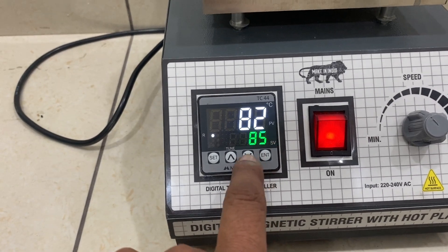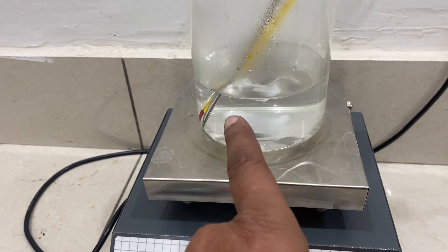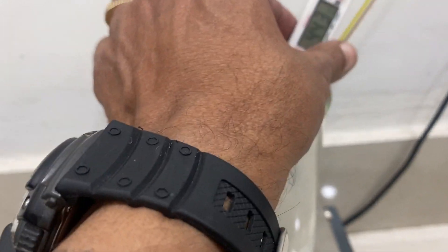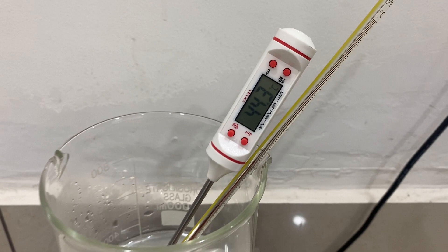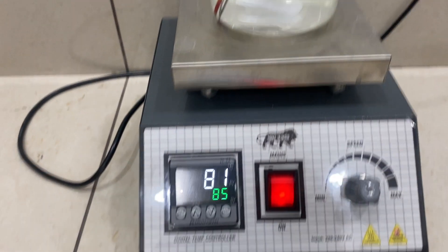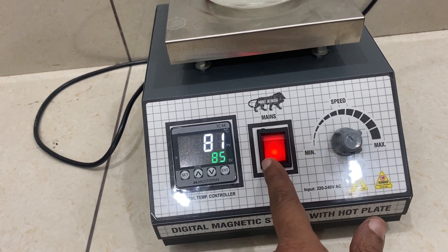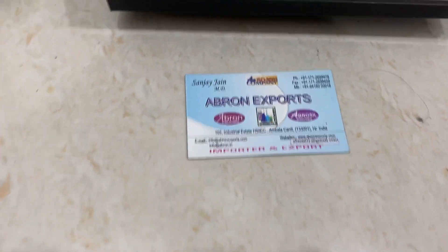This temperature display only shows you the temperature from the surface, not of the chemical. For the chemical, you have to use an external calibrated thermometer. This is very easy to use — speed control, on/off switch, and temperature controller.